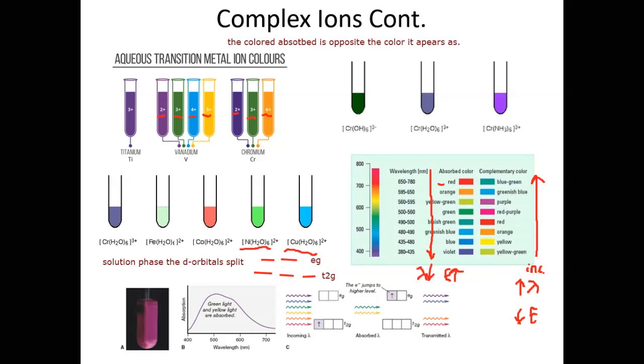And so when an electron in the T2g orbital absorbs a particular color of light, it jumps to the next energy level. Here, this electron absorbed the yellow-green light, and since it absorbed that yellow-green light, it's going to appear purple. So its absorbance would have a lambda max near the yellow-green region of the visible spectrum, and it would appear purple.